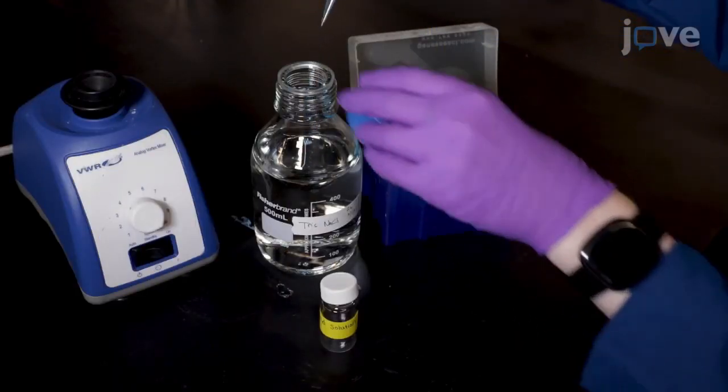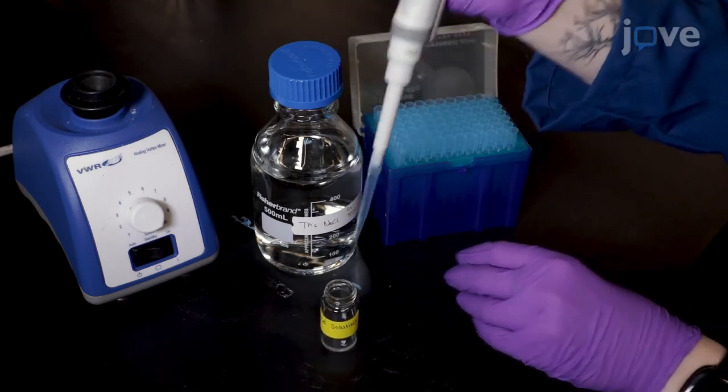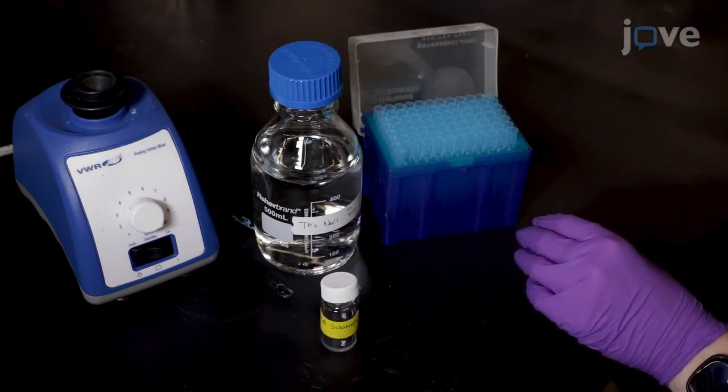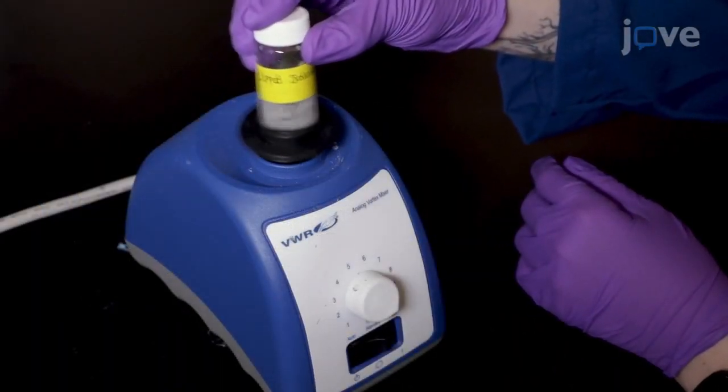Rehydrate the dried lipid film with the required volume of Tris sodium chloride buffer to yield a final vesicle concentration of 2.5 mg per milliliter and vortex for approximately 15 to 30 seconds.